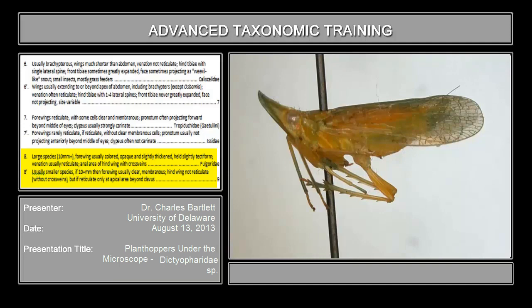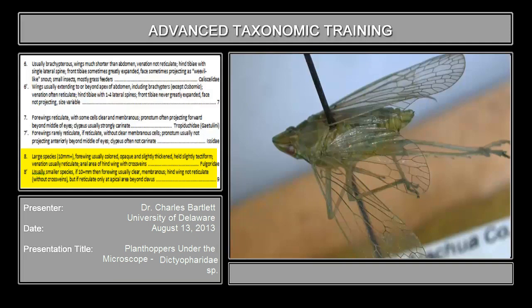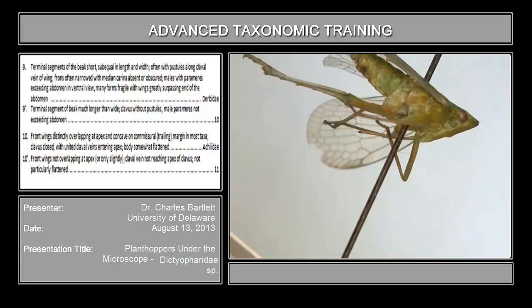Anal area of hind wing with cross veins — we could turn this upside down and look at the apex of the hind wing, but I'm going to pull out a different specimen that has the wings slightly spread. This is the hind wing right here. Does the anal area of the hind wing bear cross veins? There are a couple, but that's not what we mean by cross veins. So the answer is no, it does not bear cross veins. We're going to say it is not the family Fulguridae, and move on to couplet 9.